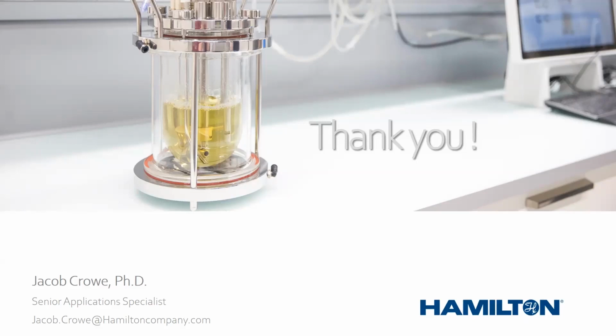And then if you don't want to mess with integration at all and you just want to collect and monitor a profile, there is no problem with just using ArcAir and collecting via experiments. I actually recommend that if you're questioning, do I really need this data? How useful is the data? Do a proof of concept. Just collect the data via ArcAir and do a proof of concept. It's a free software.